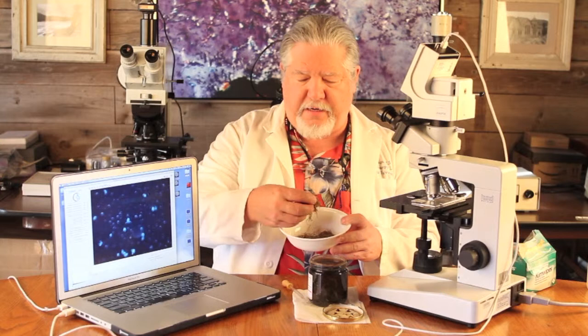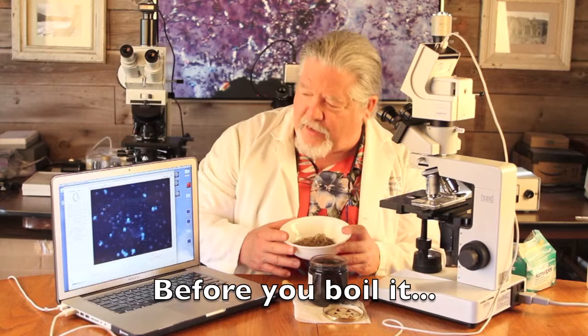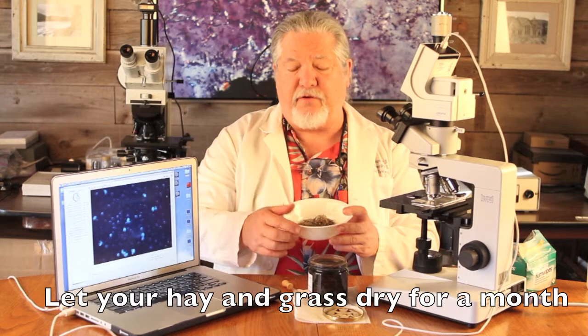Now one way to get microorganisms to view under the microscope is to use hay. Here I have some dried grass and hay that I collected from a field. You can actually make what we call a hay infusion. If you take some of this and put it in distilled water — don't use tap water, use distilled water — and boil it on the stove for a couple of hours, you may see some of the little microbes swimming around in here. That came from this hay infusion.